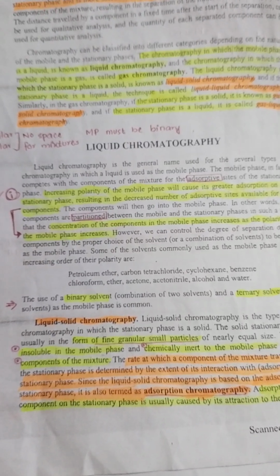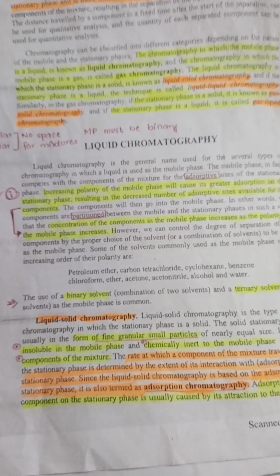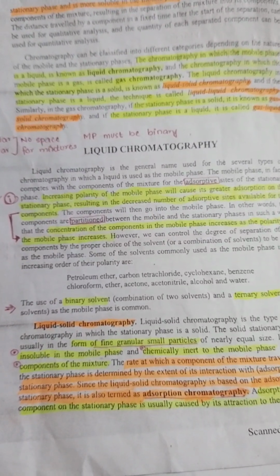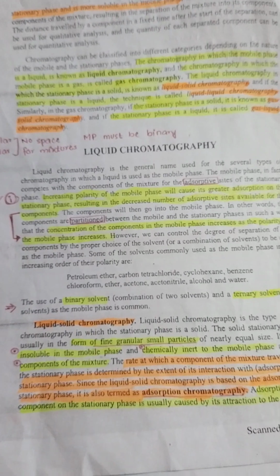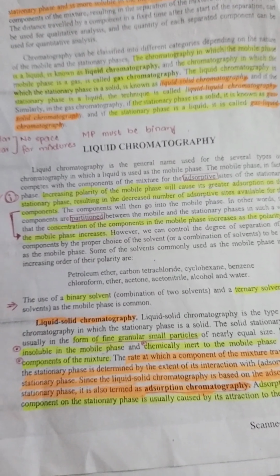Now, in the previous section, we discussed chromatography and its classification. And now we discuss liquid chromatography. What is liquid chromatography? Liquid chromatography is that in which the mobile phase is liquid.